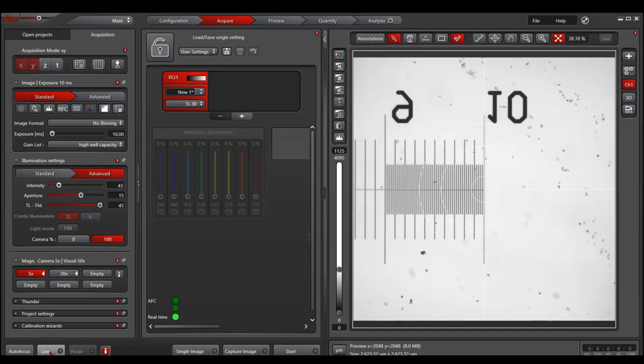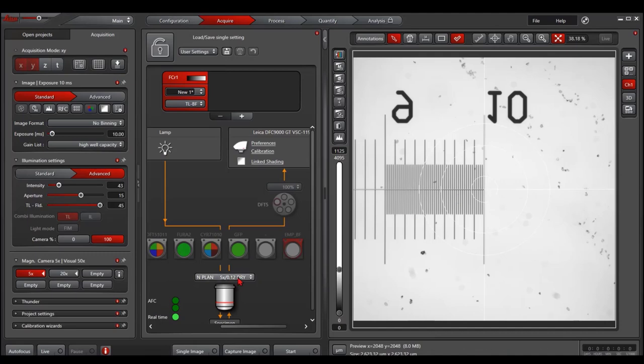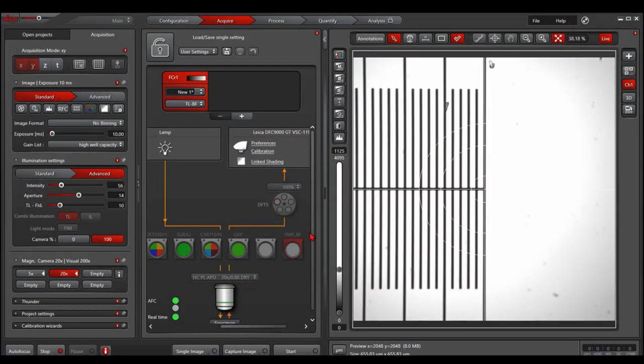So now we are back into the software. I click live. I get a picture with the 5x lens. So now I focus on the sample, center the object to the center. I switch to 20x. I should see the sample. It's focused and pretty much at the same center.